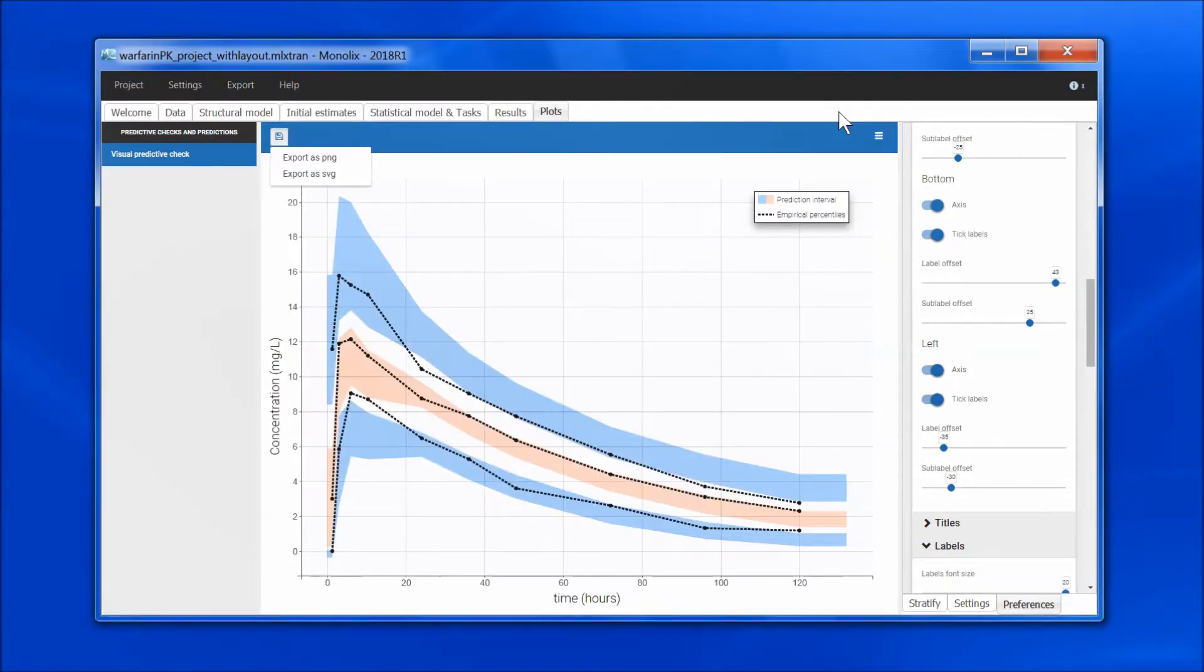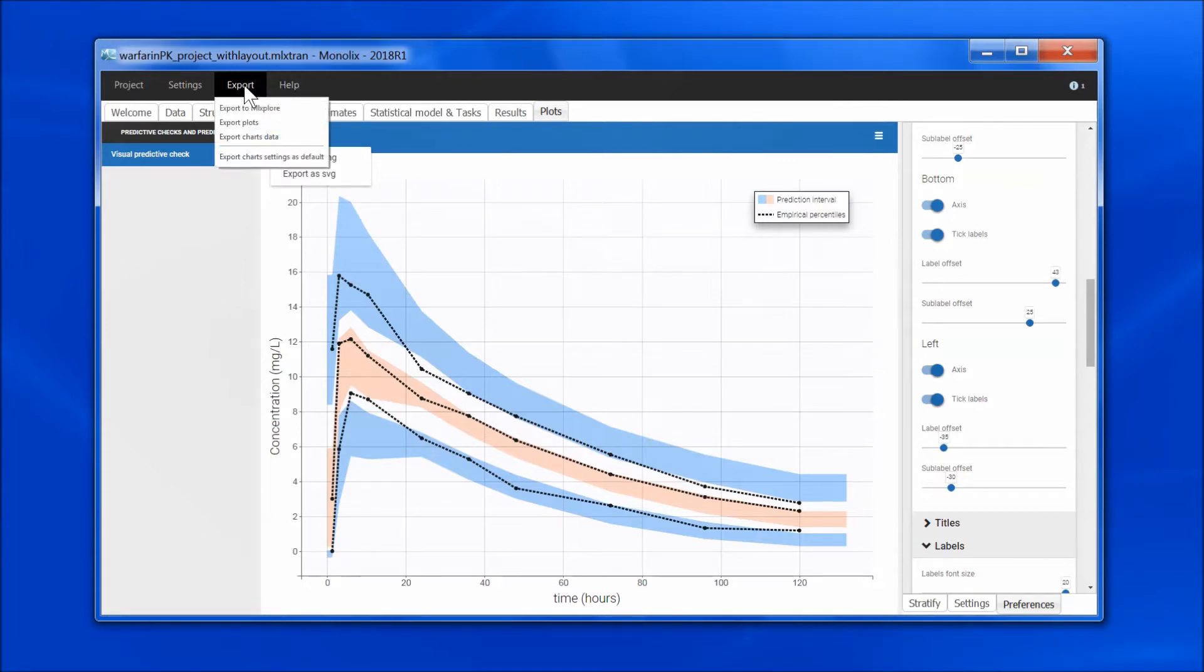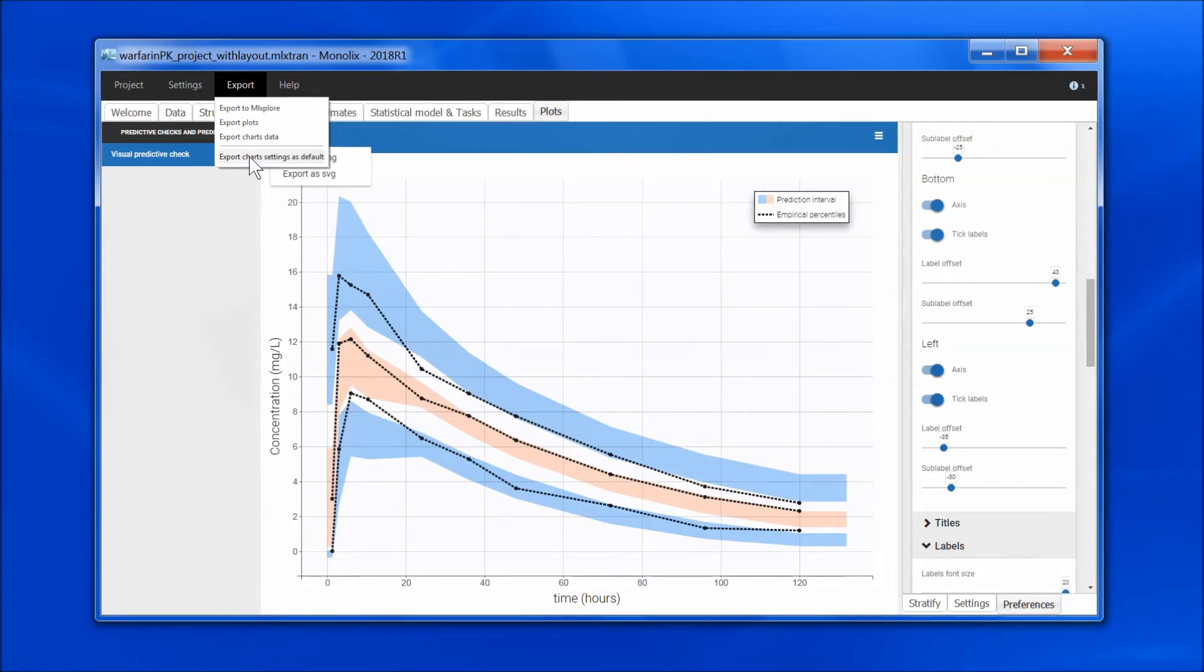I can also choose to set the preferences as default for all projects by going to export, export chart settings as default. This saves the file in the Lixir folder in your home directory, and you can send it to colleagues to share it as part of the corporate style guide for instance.